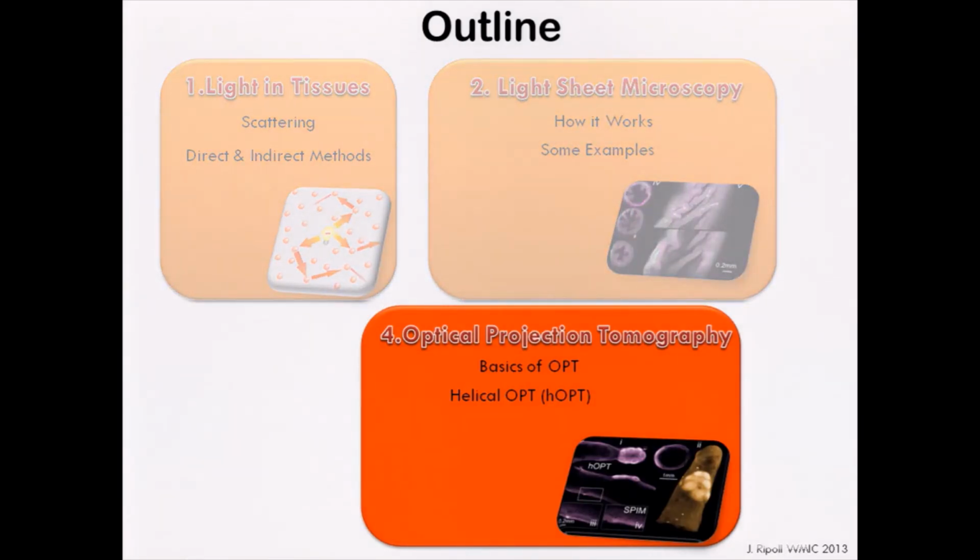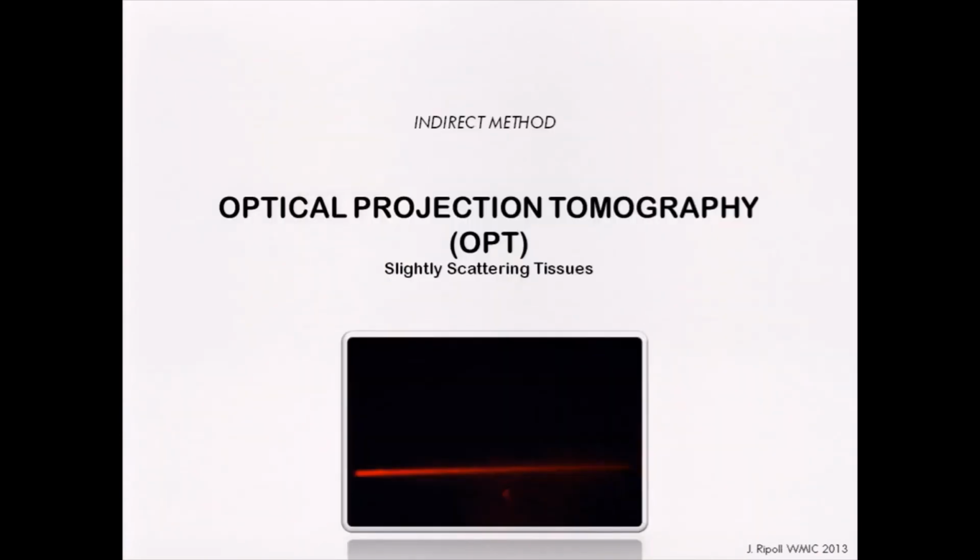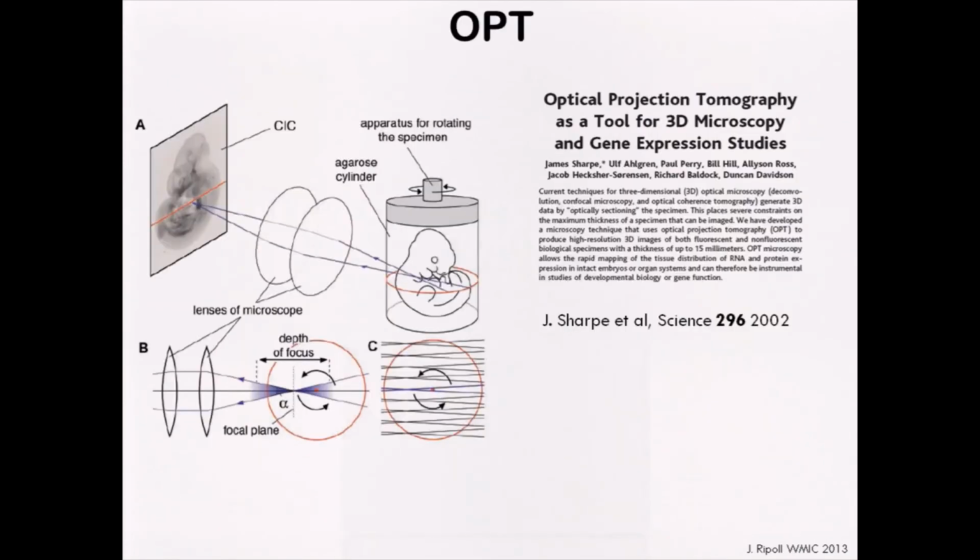Okay, so that technique dealt with the fact that we had very little scattering. And what I want to present now is another approach, very similar. If you want, the equipment you need is very, very similar, but the fact that it needs a reconstruction approach makes it, I think, more versatile. You can use it for cases where scattering is significantly present. So the idea of optical projection tomography, the concept is very, very similar to X-ray CT.